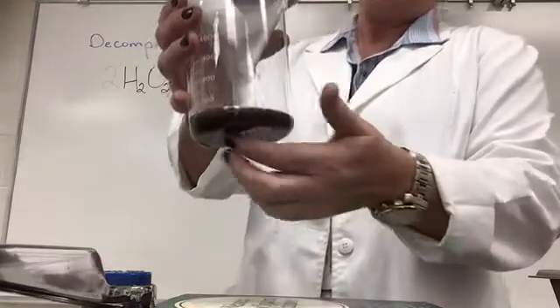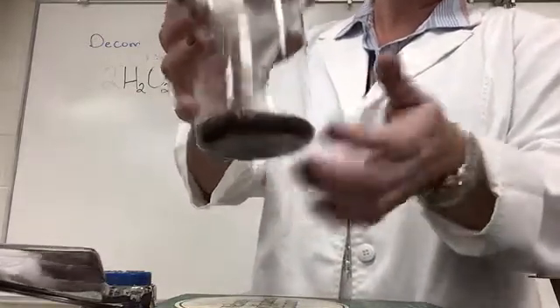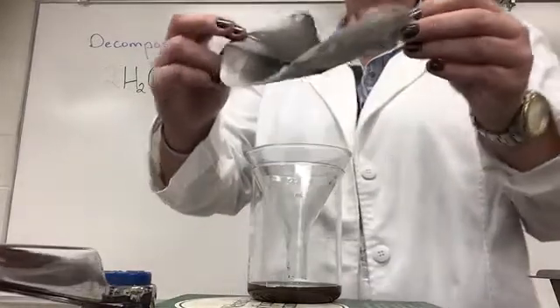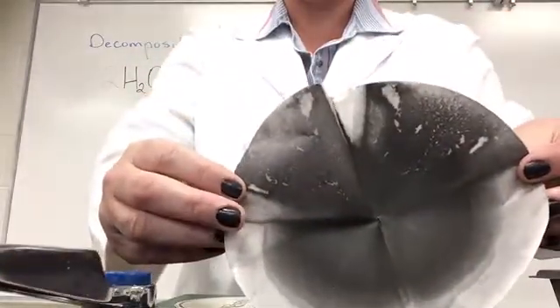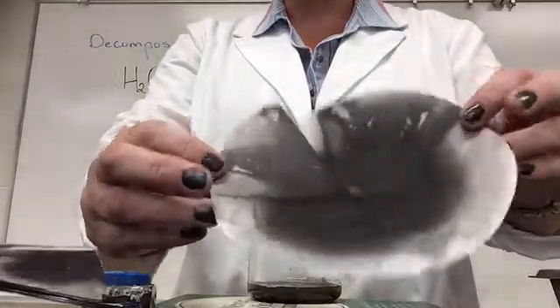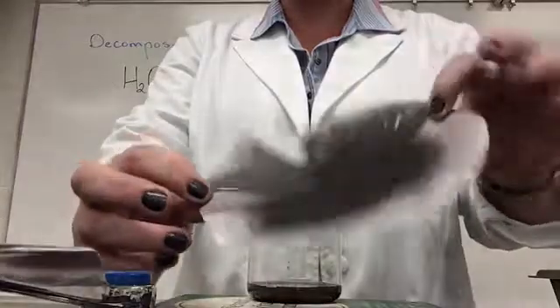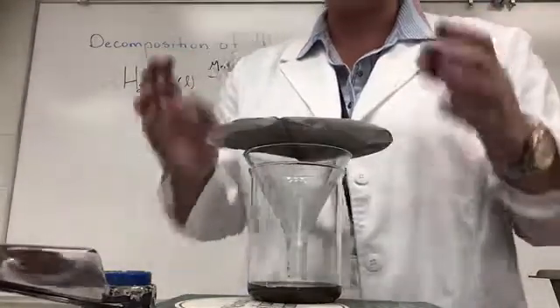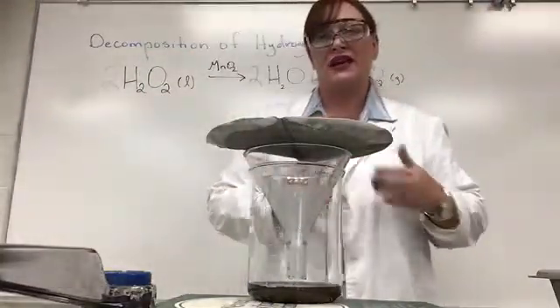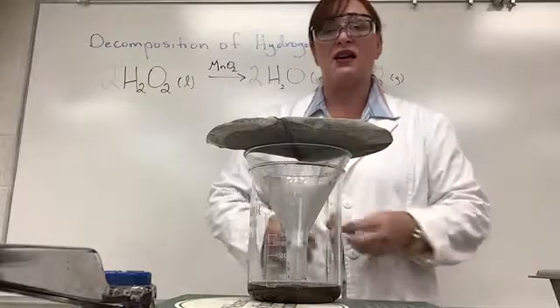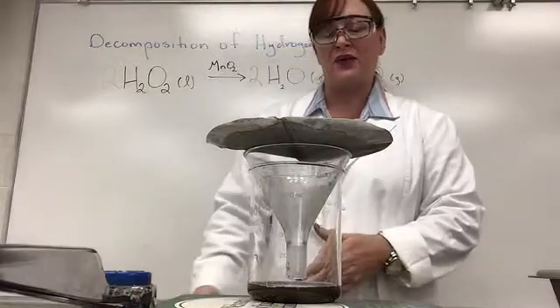And I can see that some of the black stuff did come through, but a lot of it is here on my filter paper. So the manganese, and this is exactly what I had to start with in my catalyst. So I didn't actually chemically react the catalyst with the peroxide. The catalyst just provided a temporary pathway.